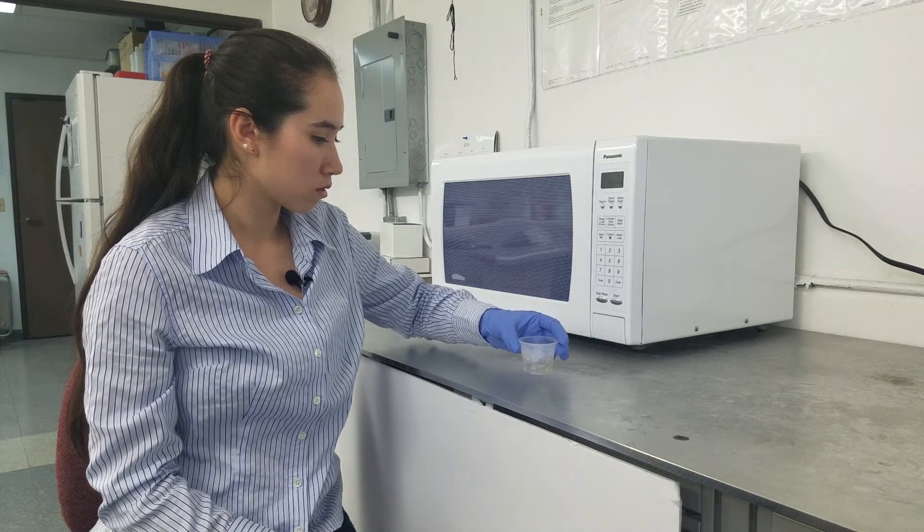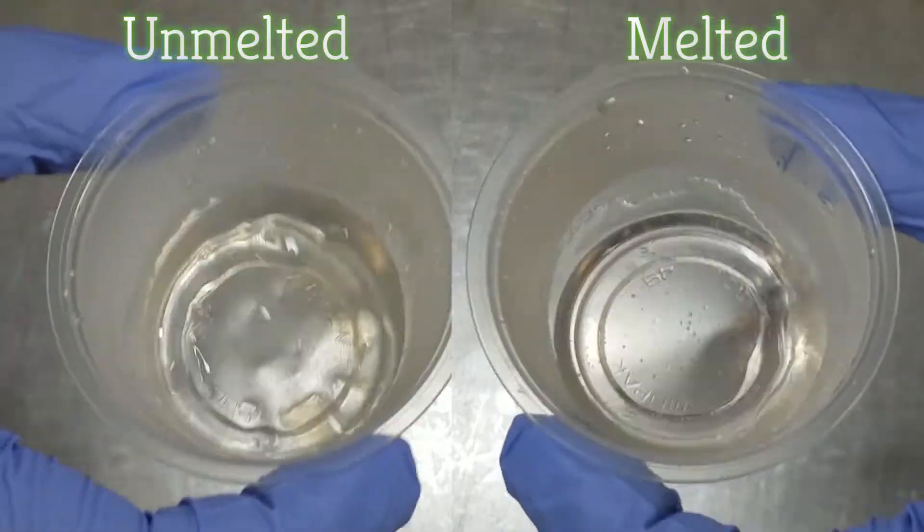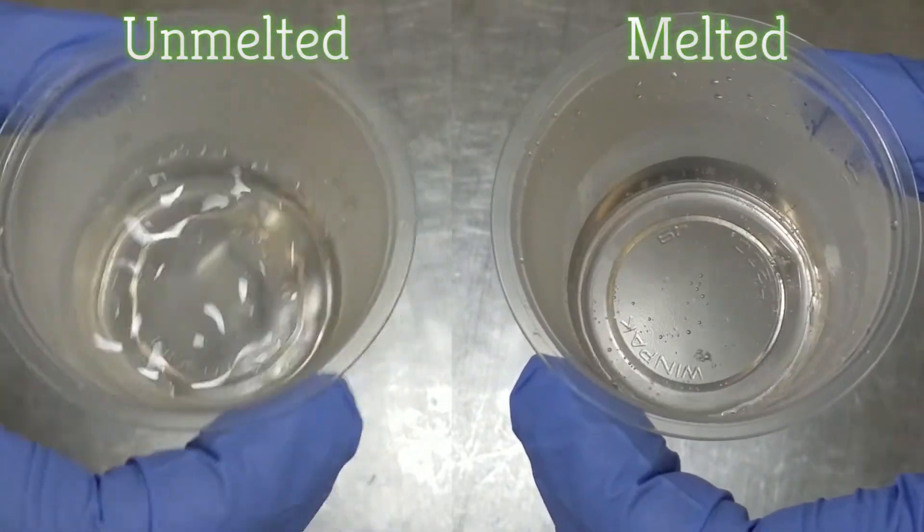One way to be sure that the agarose is completely melted is to look for any bubbles or shadows. Unmelted agarose refracts light less smoothly than melted agarose. Allow it to cool for 15 seconds.